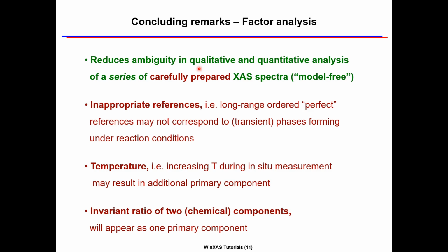Even then, additional pitfalls may have to be considered. For instance, available references at room temperature may not correspond to the phases forming under reaction conditions at elevated temperatures. Changes to the XANES region with temperature will affect both target testing and quantification.